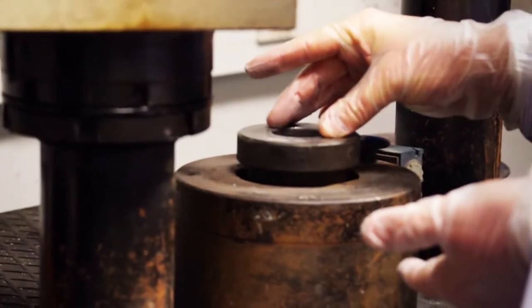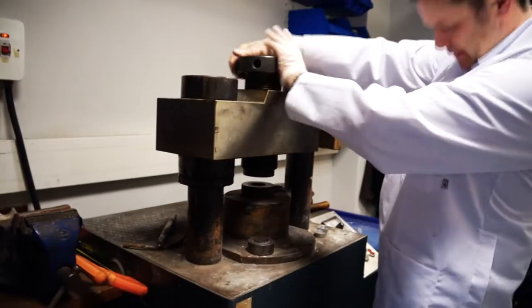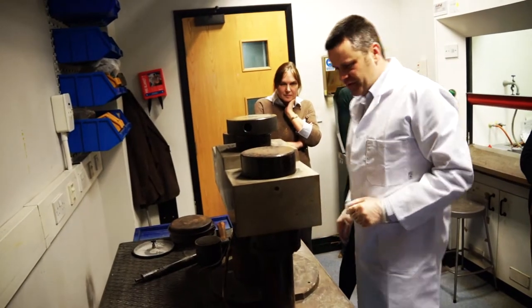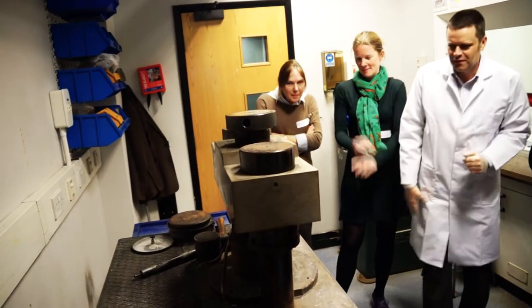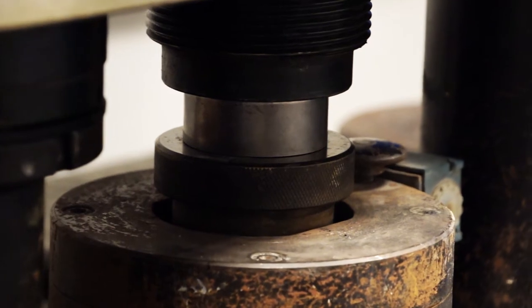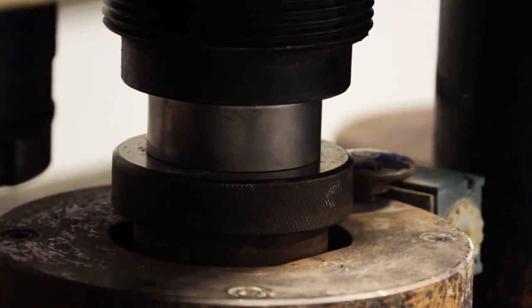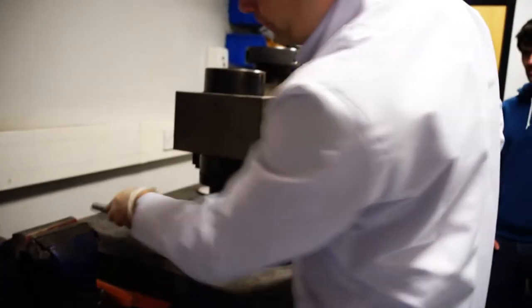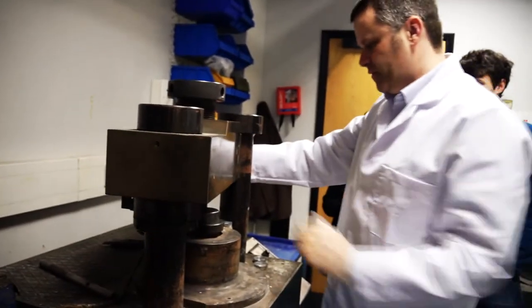And all we've got here is a large press with a small space here in which we put the powder in an aluminium can, put the lid on, and it applies about 50 tonnes of pressure to that small aluminium can with the powder in it. And just the pressure alone makes it stick together and then we have a nice solid consolidated powder ready for analysis.